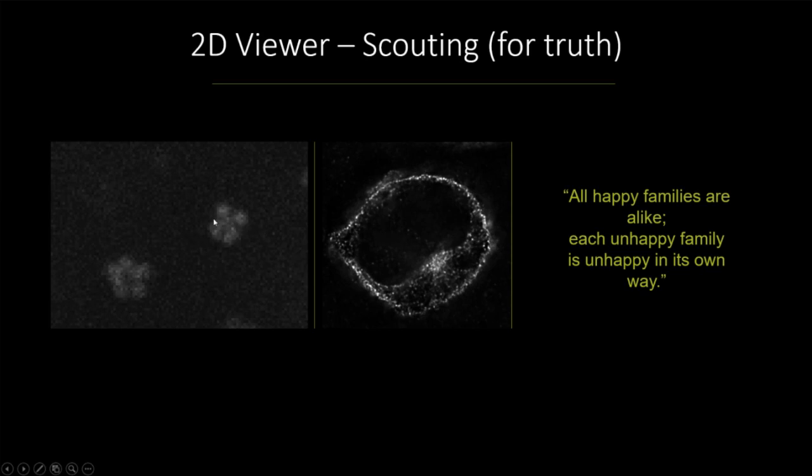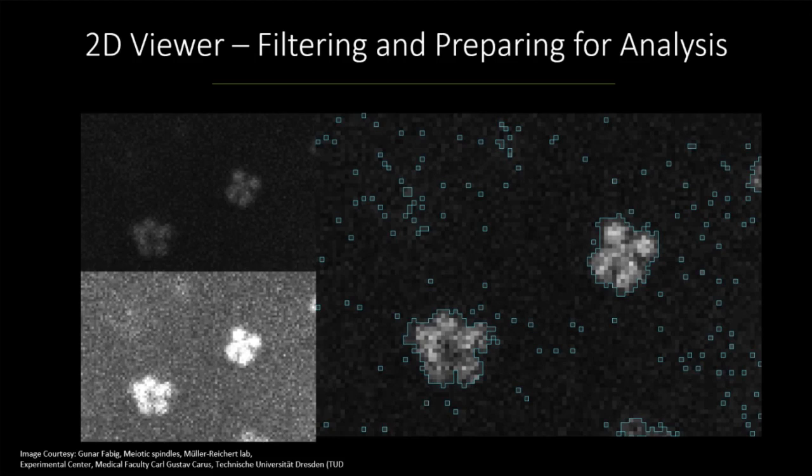We have to be able to move through the planes and the volumes and find these regions of truth, these objects that we know really exist and we really want to grab in a certain way. And then we also have to be able to find the problems. Once we find the truthful objects and the problematic objects, we can really build an analysis paradigm for that image. So let's have a quick look at some of the paradigms.